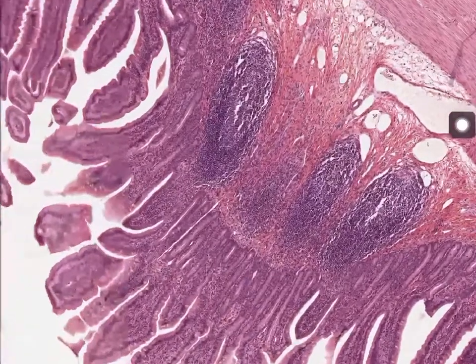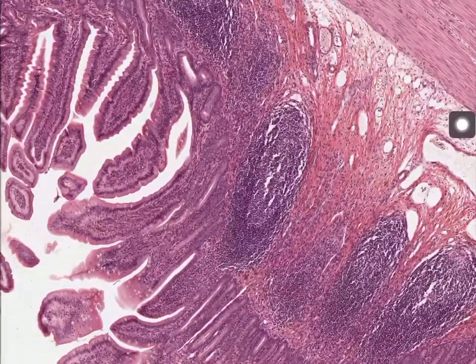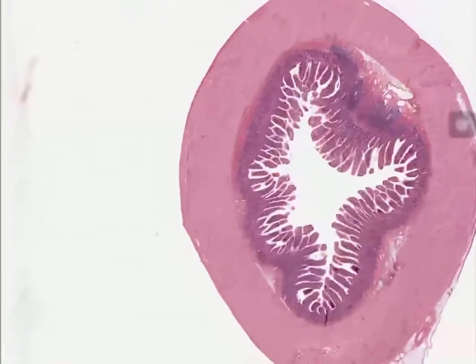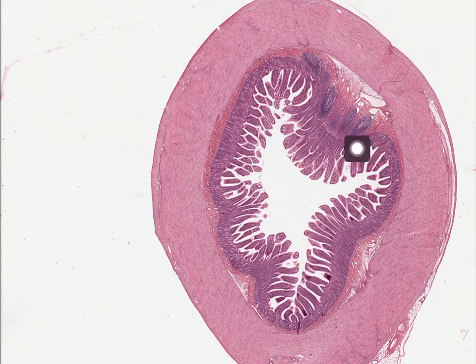Peyer's, don't really care again. But what they are, they're secondary lymph follicles, right? And they're forming patches in the submucosa, all right? And now, just like the Brunner's glands for the duodenum, these Peyer's patches are only found in the ileum of the small intestine. All right, so looking at a big piece, you can see the secondary lymph follicles right here. These Peyer's patches.